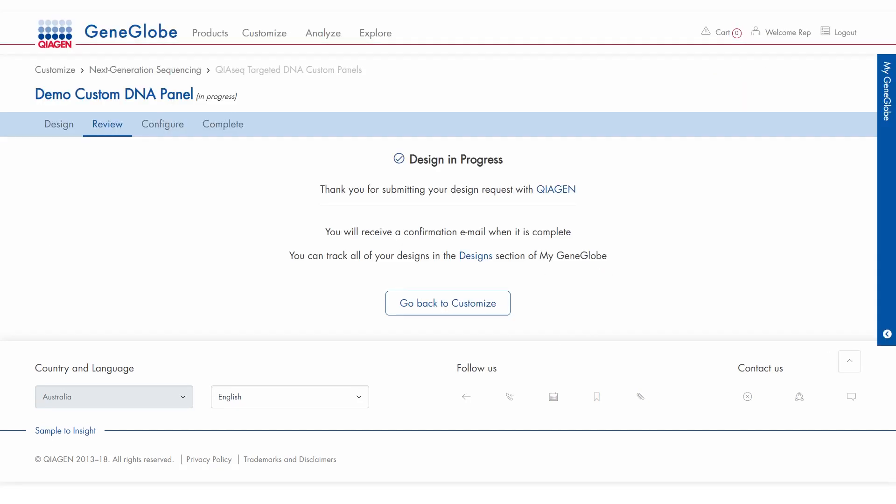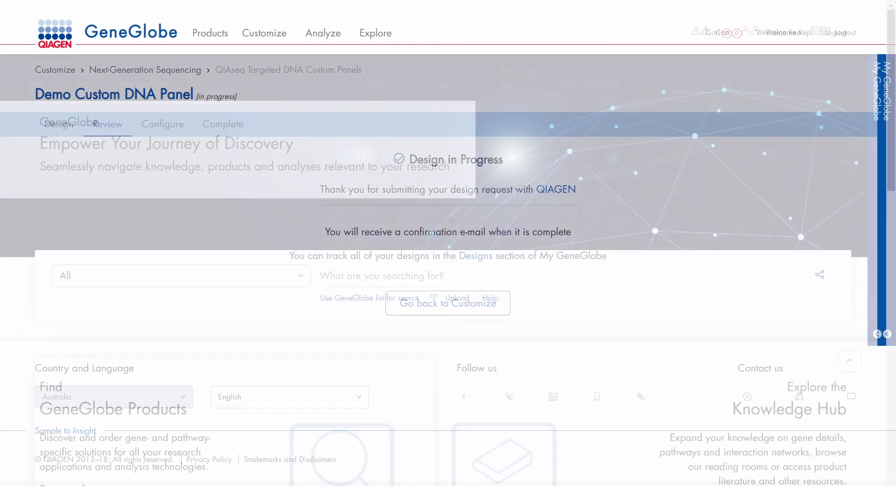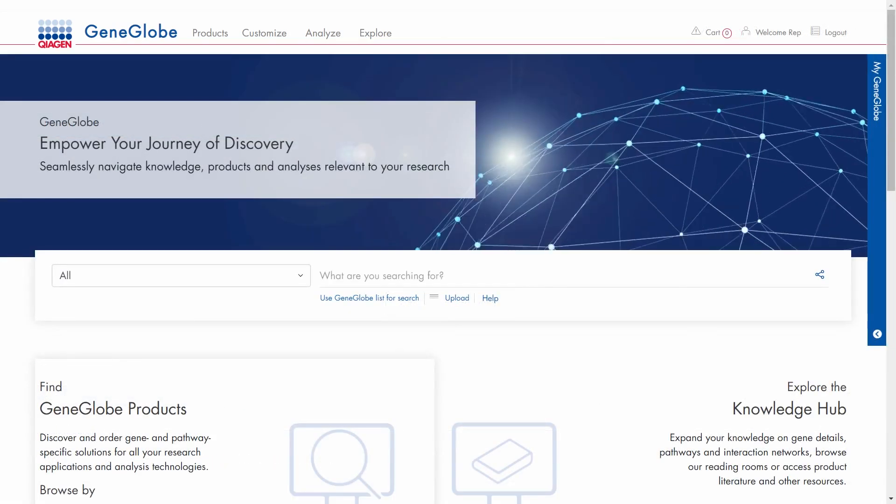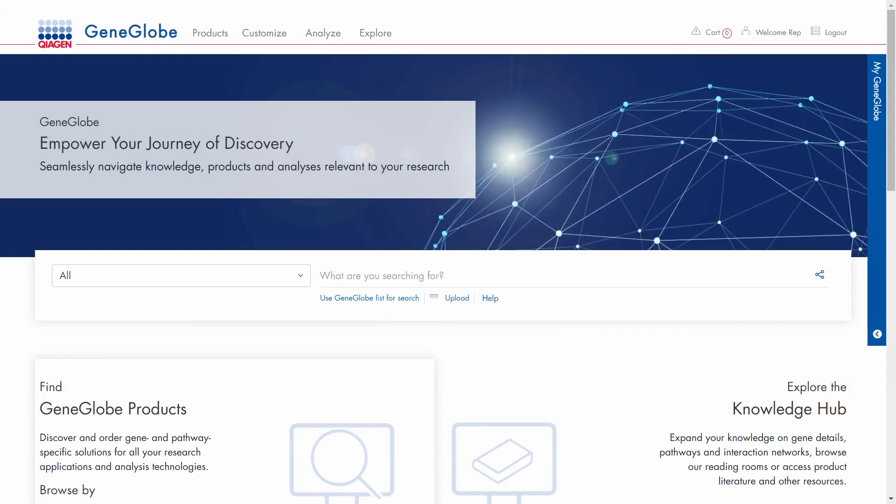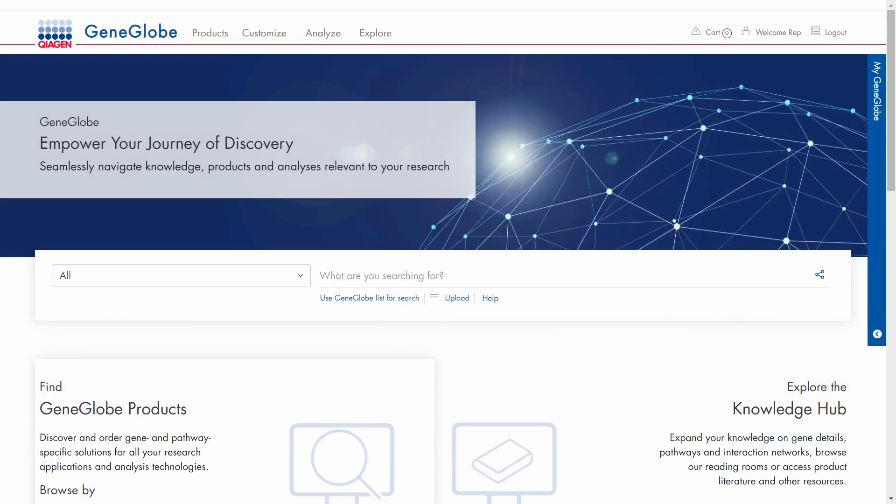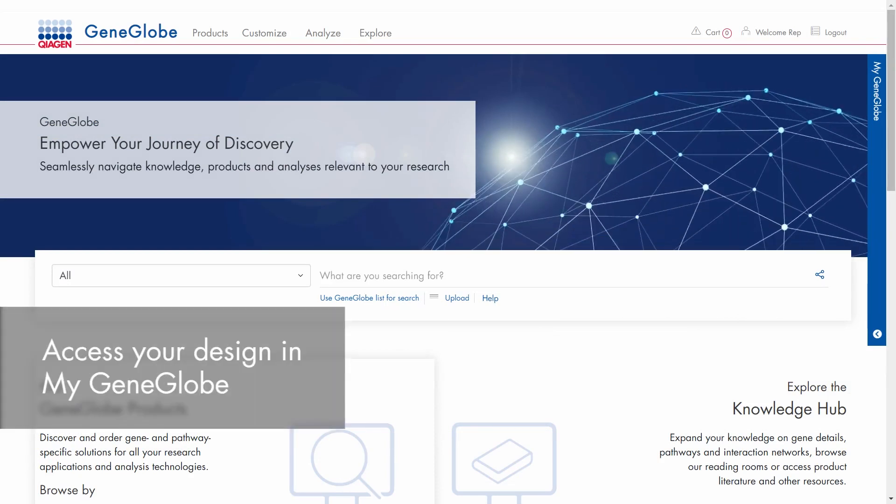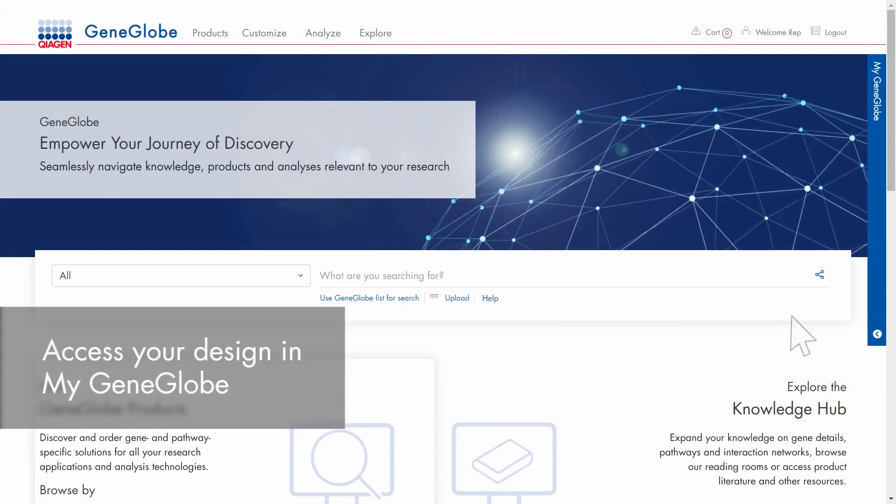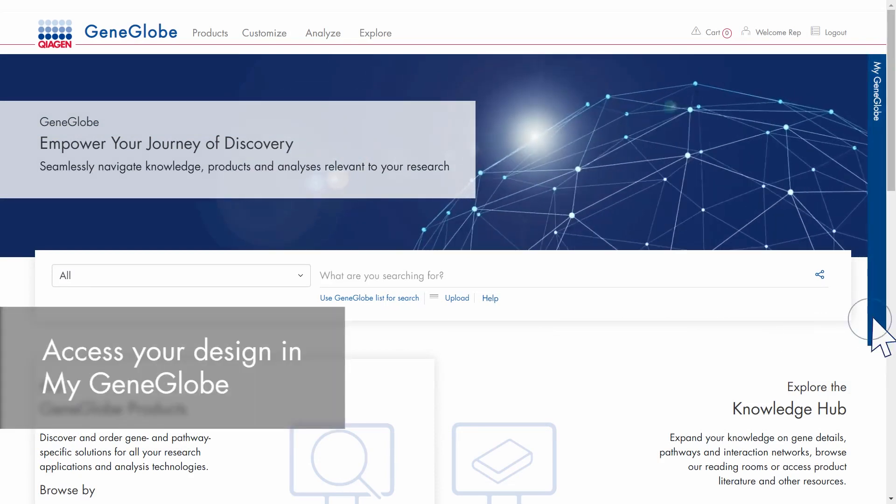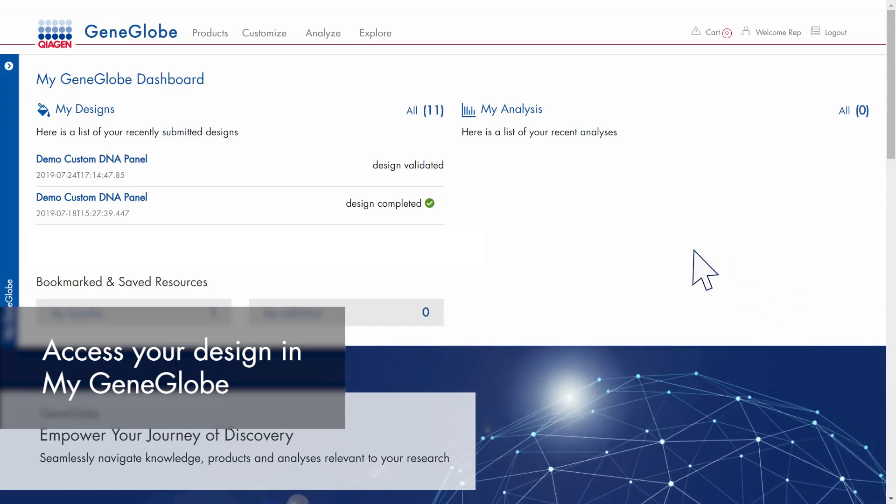We will email you when the design validation is complete. Review your design details by clicking on the link we sent or by opening the MyGeneGlobe dashboard.